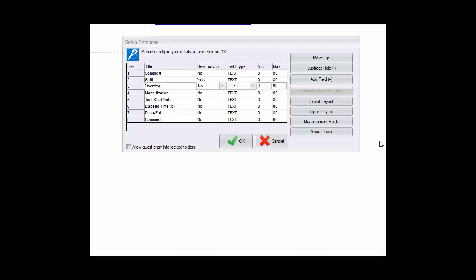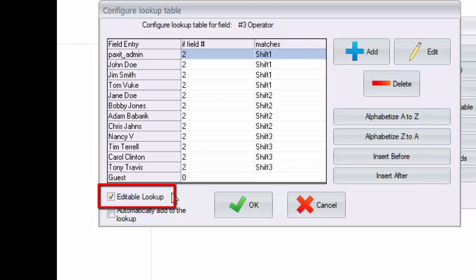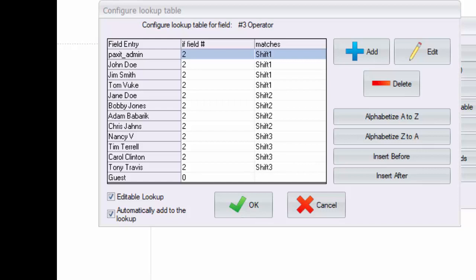The operator field will also be a drop down list and in this case we will expand the functionality a bit. First we'll make it editable. An editable lookup table is one where the user may choose from the entries in the drop down list or they may type something else in on the fly. In fact Paxit can have the new entry that is typed on the fly automatically added to the drop down list so that it becomes part of the lookup table moving forward.